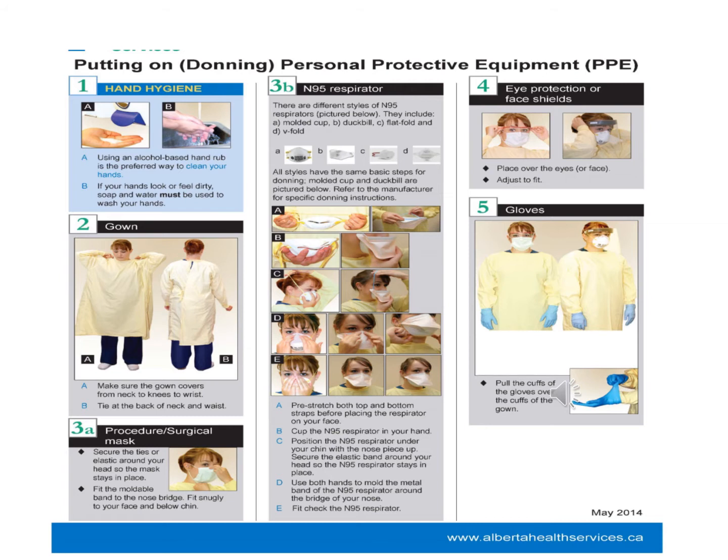And in number four, you also have to wear the face shield, which also protects your eyes. This is very important, and you should place it over your eyes and face, and you can adjust it according to your face size because it is adjustable. And then lastly you wear the gloves, because now your hands are free. You have already put on the gown, the mask or respirator, and the shield, so now lastly, wear the gloves.